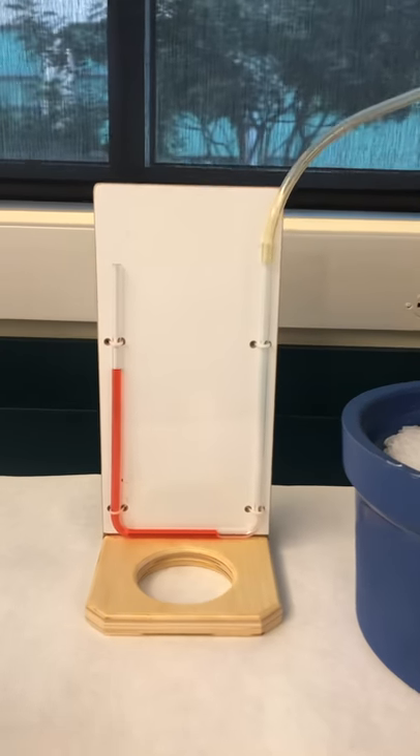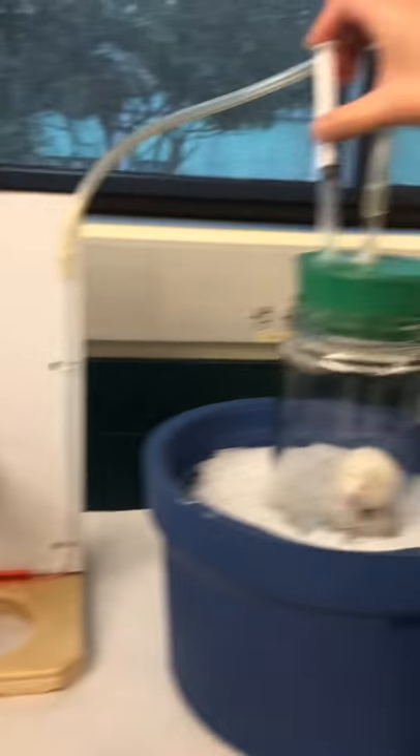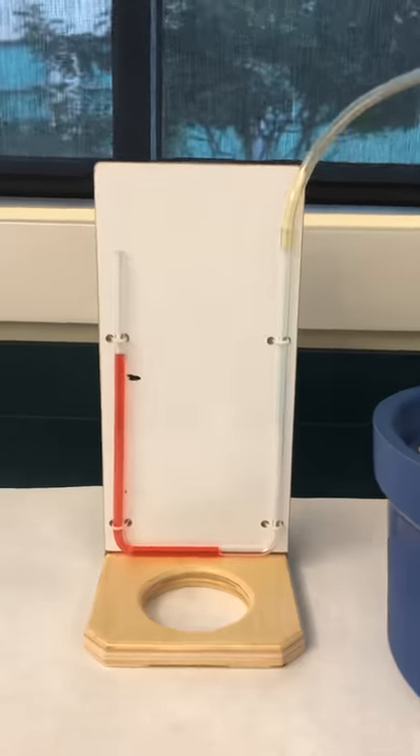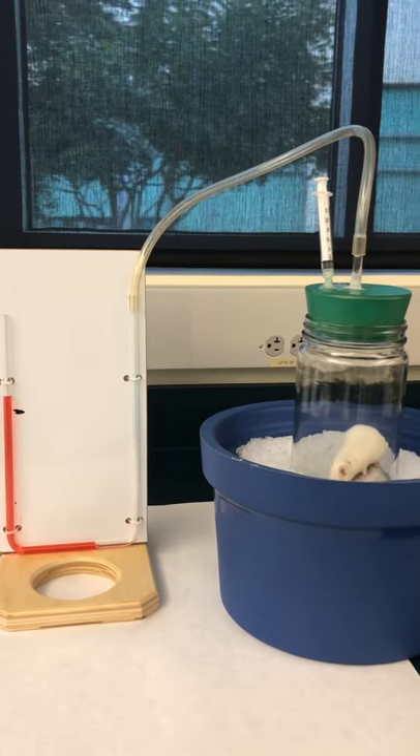Our fluid level has gone up. We're going to mark it and inject the two cc's. Start timing. I'm going to see if the mouse consumes oxygen faster or slower when it's cold.